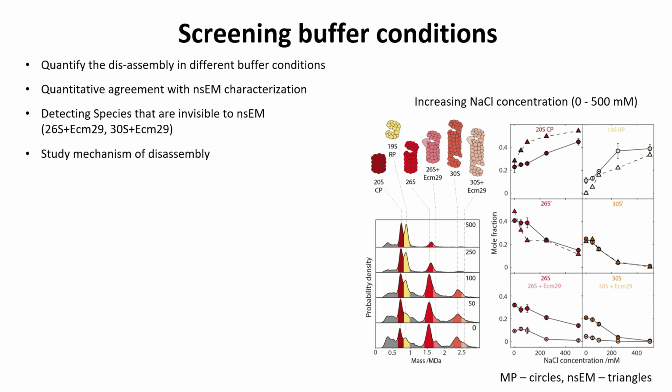We quantified it both in negative staining and in mass photometry, and you can see the results agree quite nicely.